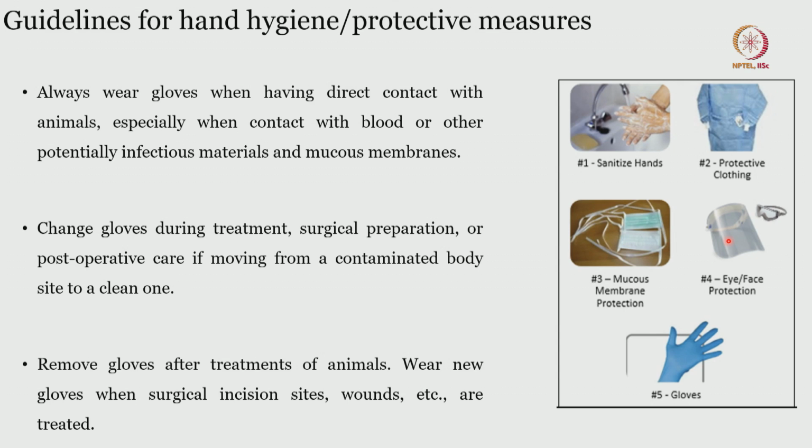So that sort of measure needs to be considered, and you need to make sure that the entire scrub suit is discarded while you are leaving the lab, and make sure all those accessories and the scrub suit that you have used are also disposed of in the right way. That is very important, all right.